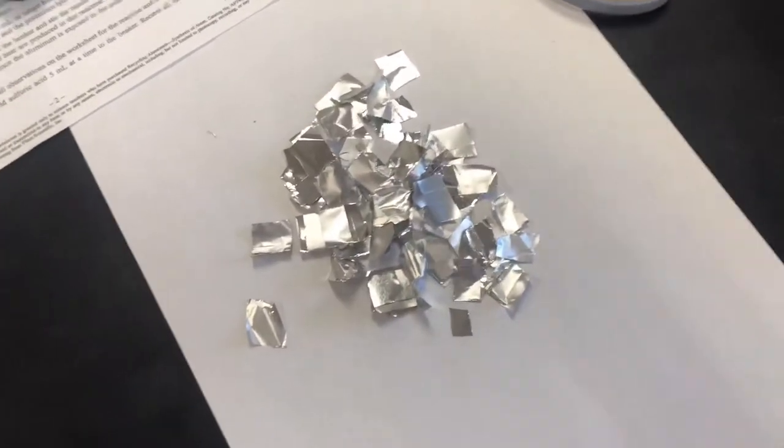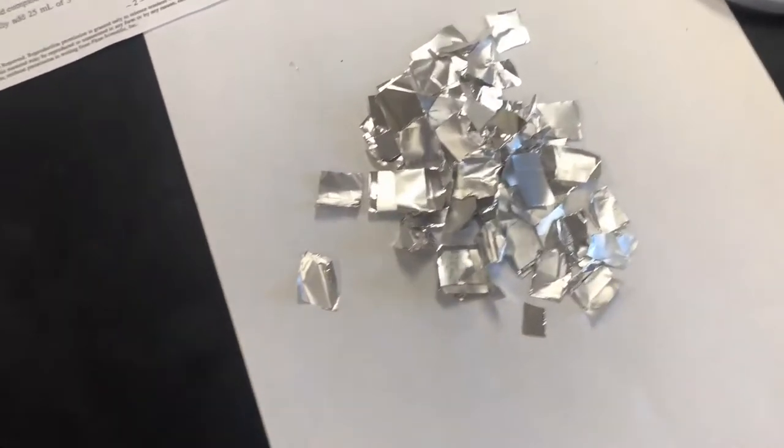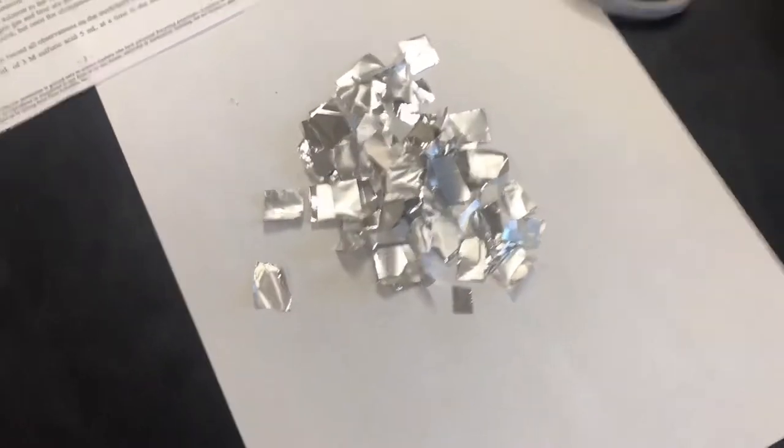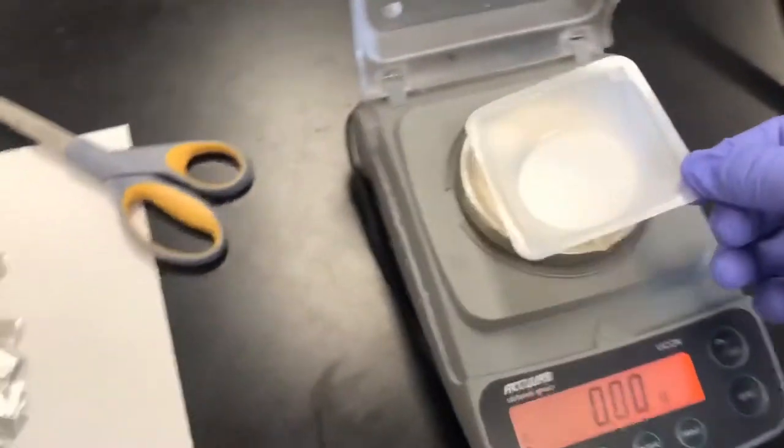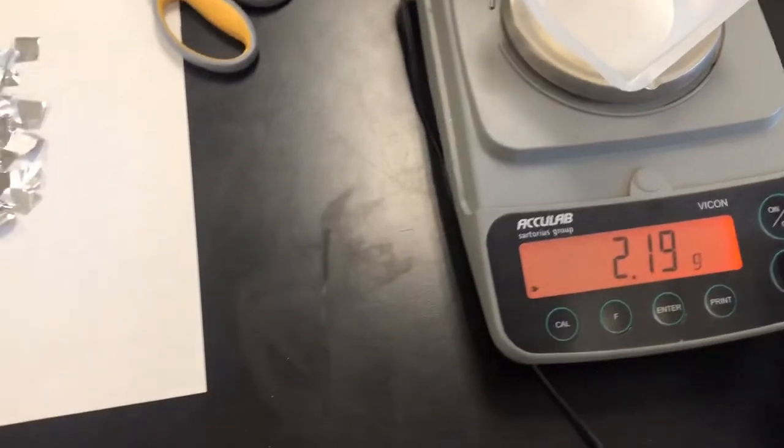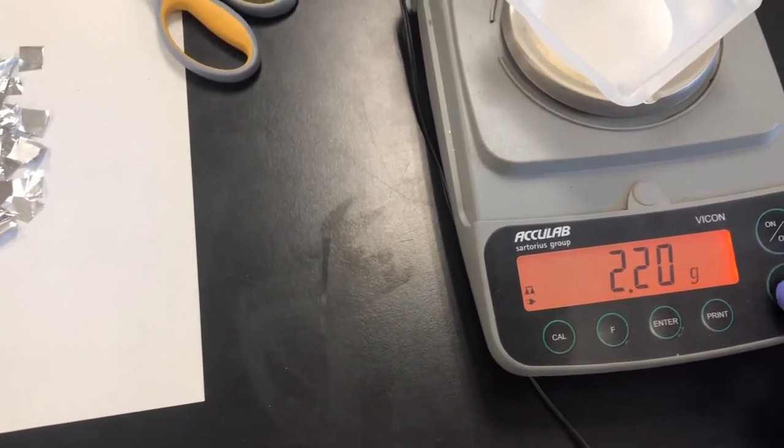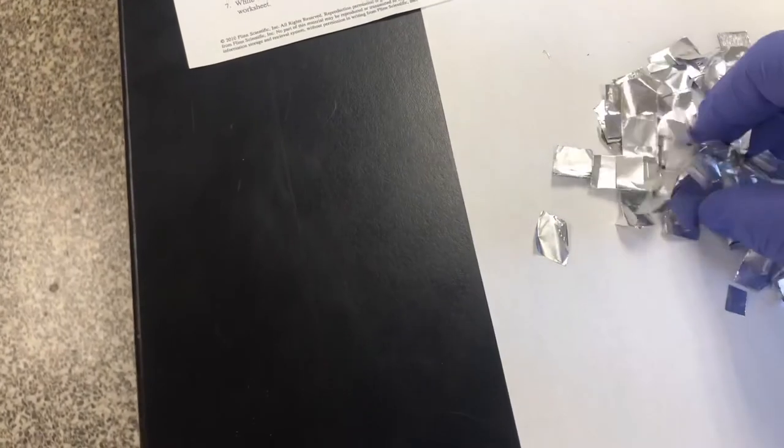We have some aluminum already. This has been cut up. We need to tear our weighing dish. We're going to hit zero and we need to get as close to 0.75 grams as possible.